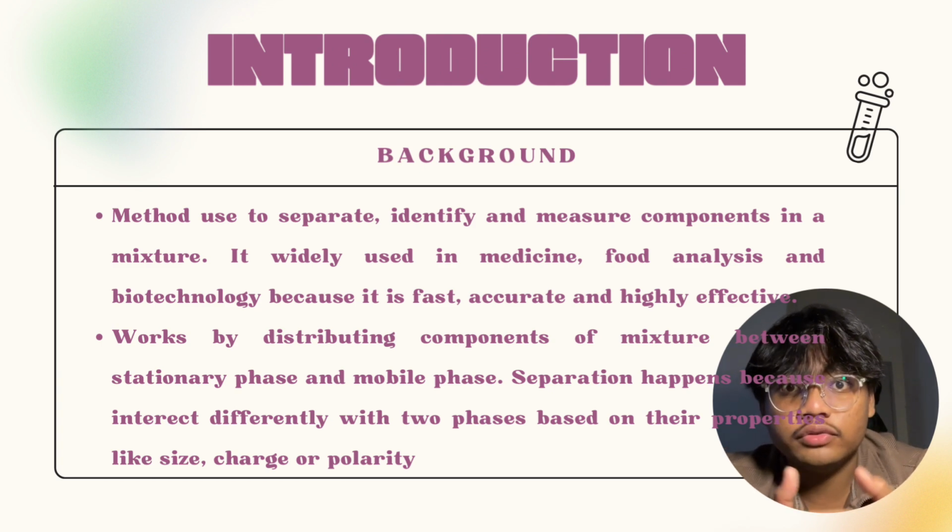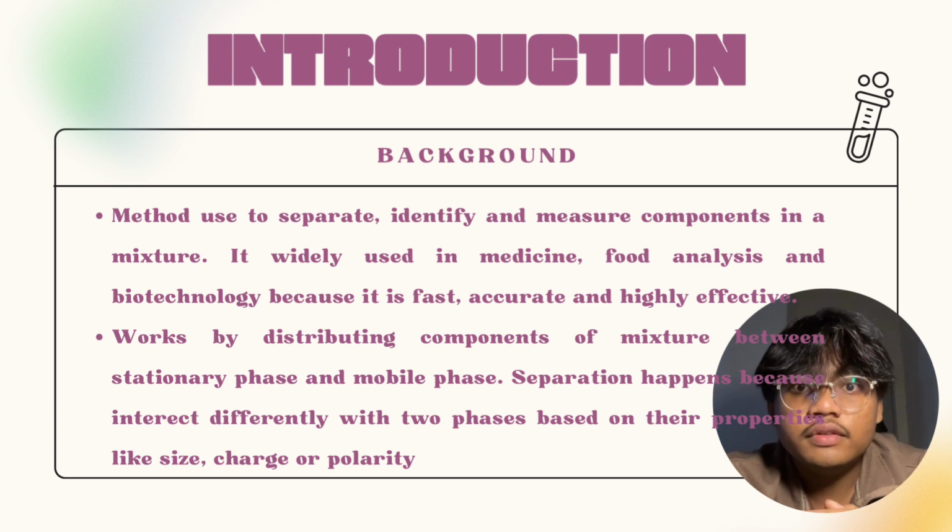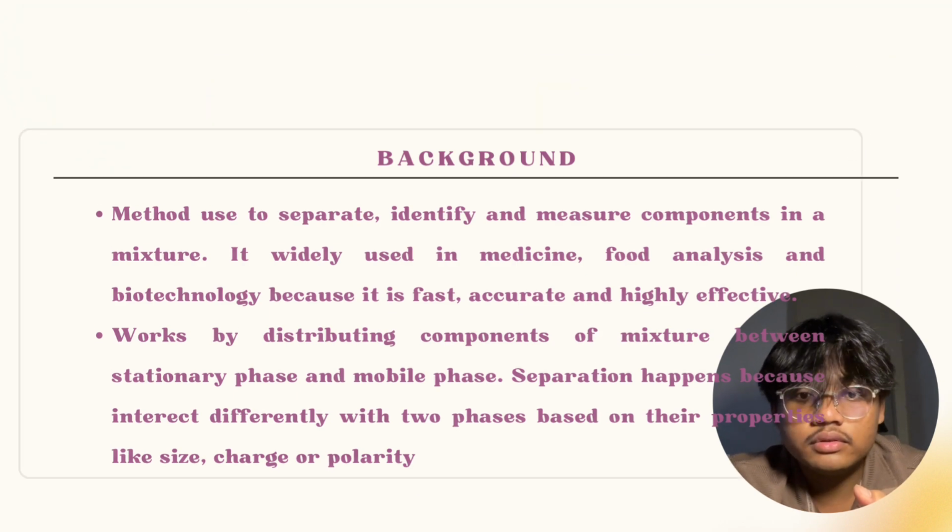So for the introduction, this experiment is related to chromatography. Chromatography is a technique to separate, identify, and measure components in a mixture. It's widely used in medicines, food analysis, and biotechnology due to its speed, accuracy, and efficiency. It involves two phases. The first phase is the stationary phase and the second one is the mobile phase. Components separate based on their interaction with these phases. Techniques like gas chromatography (GC) and high performance liquid chromatography (HPLC) are used for analyzing substances in various fields.